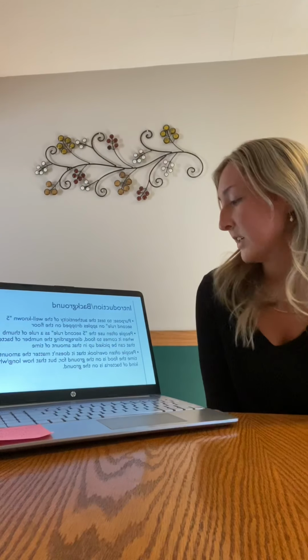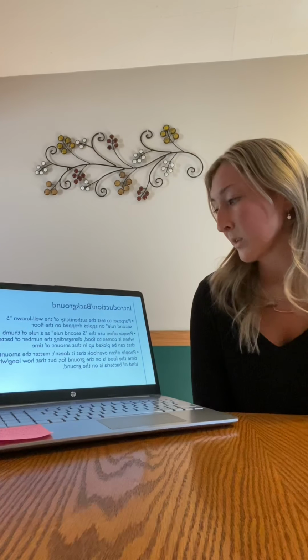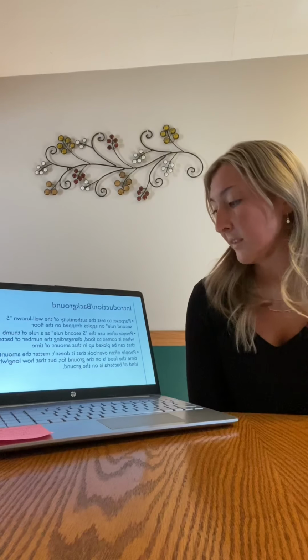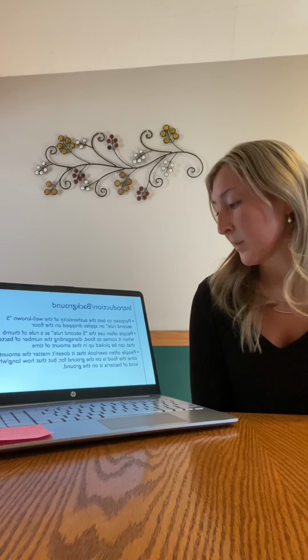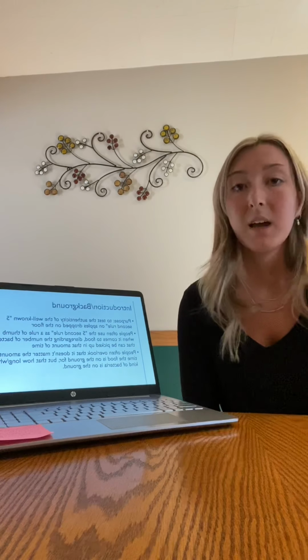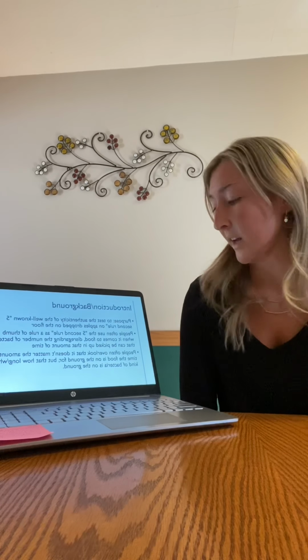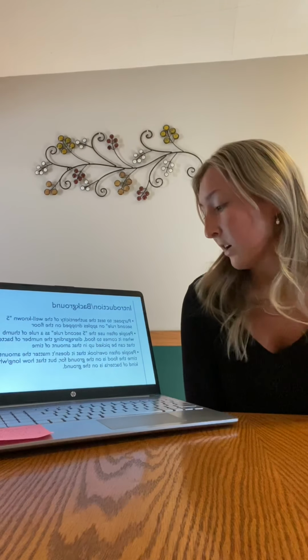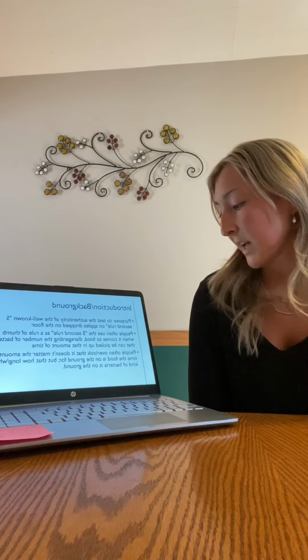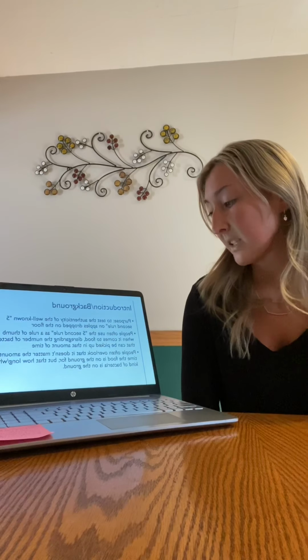So my introduction purpose was to test the authenticity of the well-known 5-second rule on apples dropped on the floor. People often use the 5-second rule as a rule of thumb when it comes to food, disregarding the number of bacteria that can be picked up and the amount of time. Everyone has used the 5-second rule once or twice in their life, and everyone disregards that you can pick up really harmful bacteria on the ground and then ingest it later. People often tend to overlook that it doesn't matter the amount of time the food is on the ground for, but how long or what kind of bacteria is on the ground.